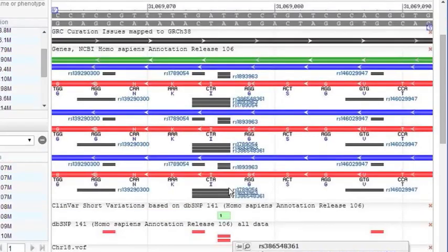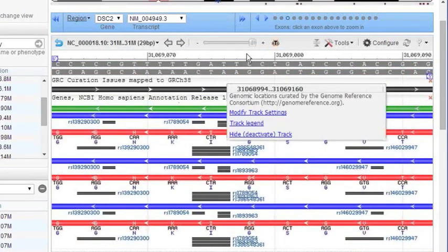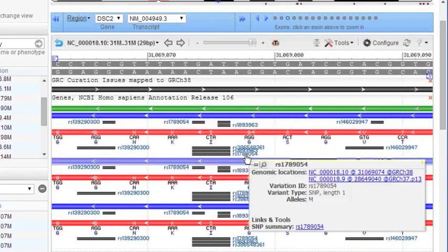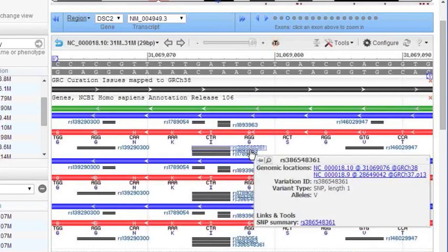They represent exactly the same change. And if you look at the codon here, remember, we're on the opposite strand, so it's ATC, reading this way. Notice that the variations have been mapped onto the objects in the viewer, so you can see the variants on the nucleotide sequences. And then when there are variations on the protein, of course, those are affecting the entire codon, and so you can see them there. And you can see that there are actually two of them. The one allele changes the last position of the codon, makes it a methionine codon, and the one that we're looking at changes the isoleucine to a valine.